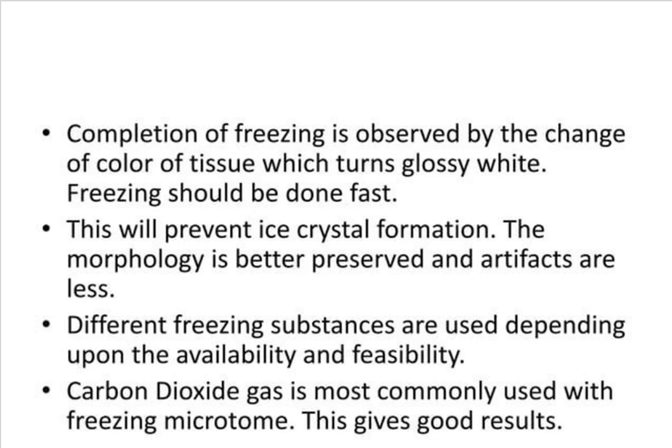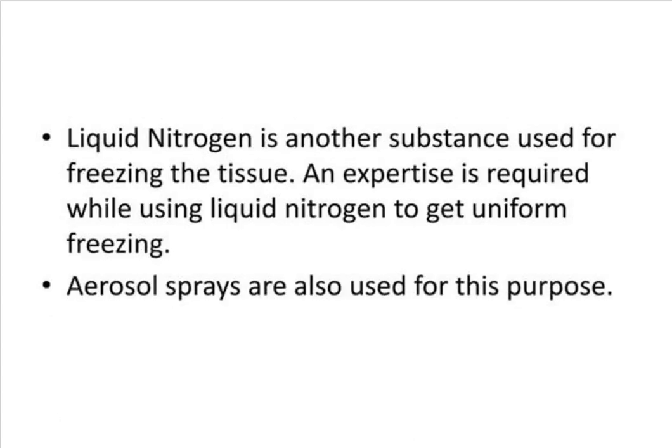These freezing substances are used depending upon availability and feasibility. Sometimes carbon dioxide, sometimes liquid nitrogen, anything can be used. Carbon dioxide is used in the freezing microtome, which is easy to use. Liquid nitrogen is highly used nowadays, even in culinary aspects.